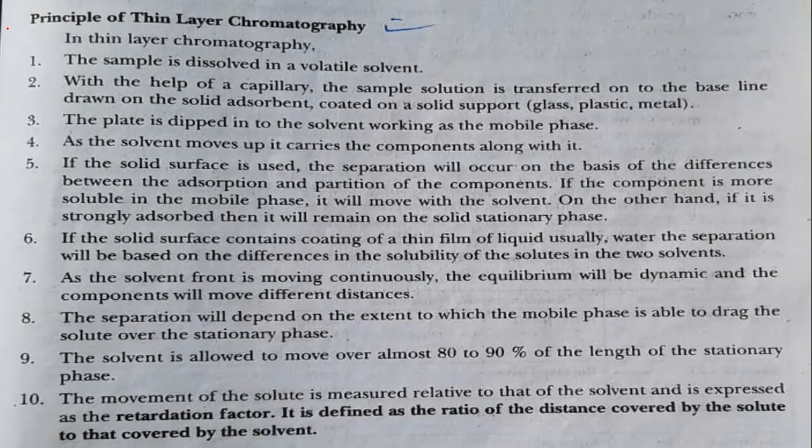After that there is thin layer chromatography. Remember, all the things are similar in paper chromatography and thin layer chromatography, except that in paper chromatography the stationary phase is liquid, and in thin layer chromatography the stationary phase may be solid or liquid. In paper chromatography, only paper is used.